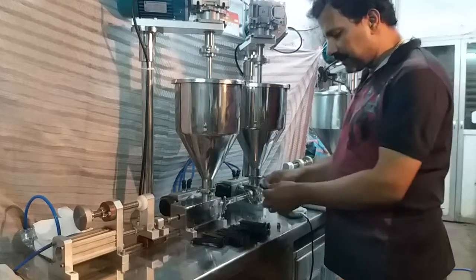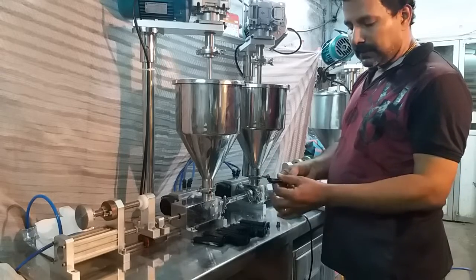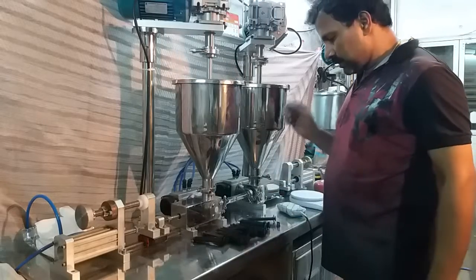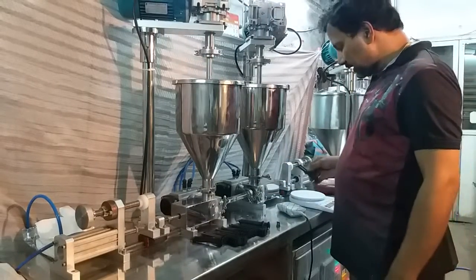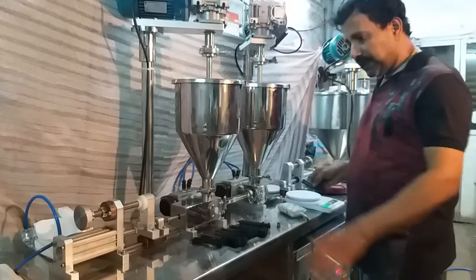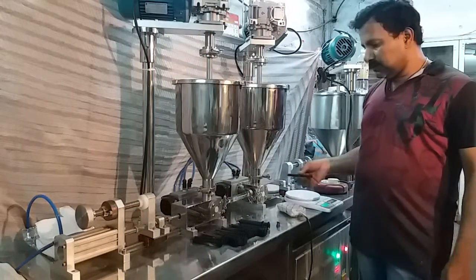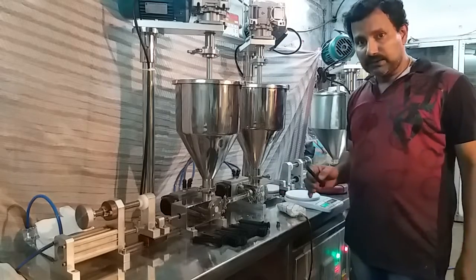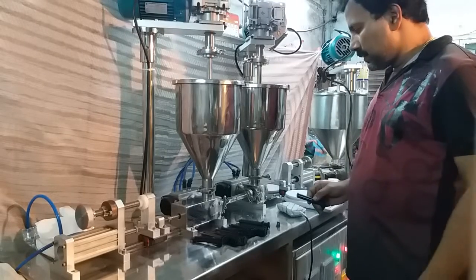I have some cartridges here. These cartridges have a main body, a plunger inside, and a piston. I have checked the weight of this empty cartridge, which shows around 9 grams. Each head will discharge 3 cc or 3 grams of product, so we should get 6 grams of total filling combined from both heads.